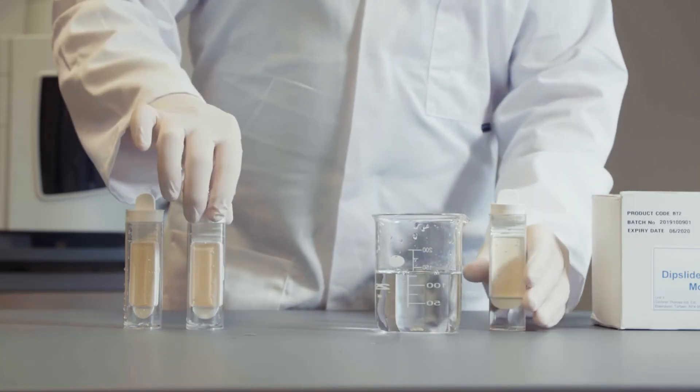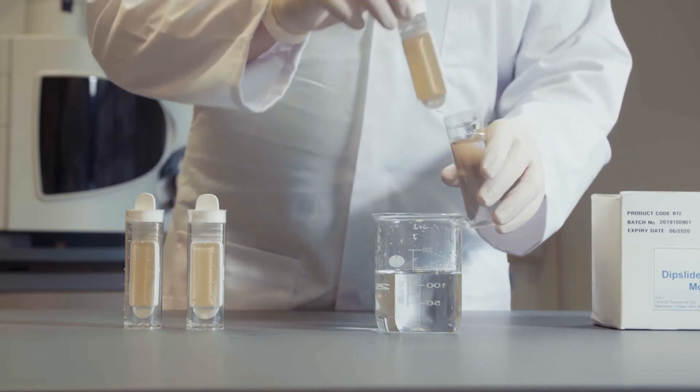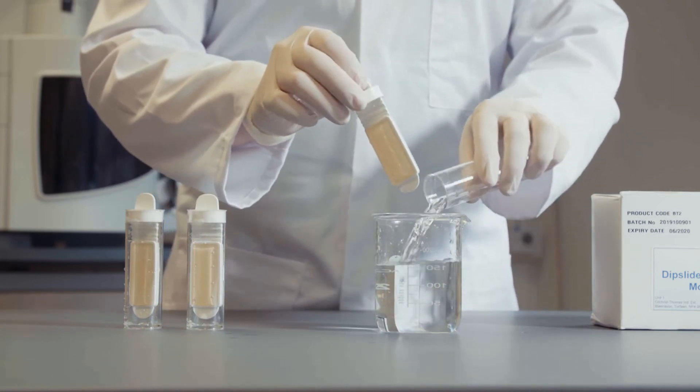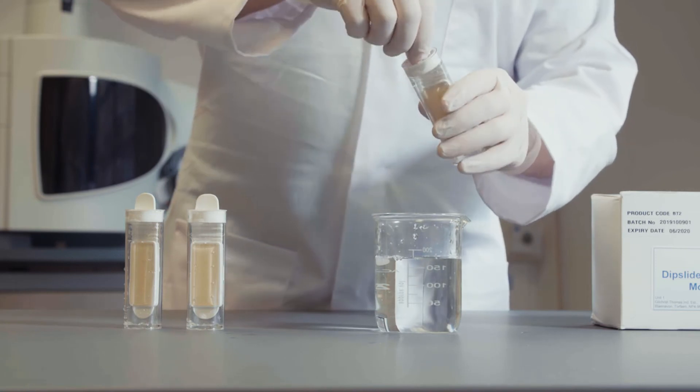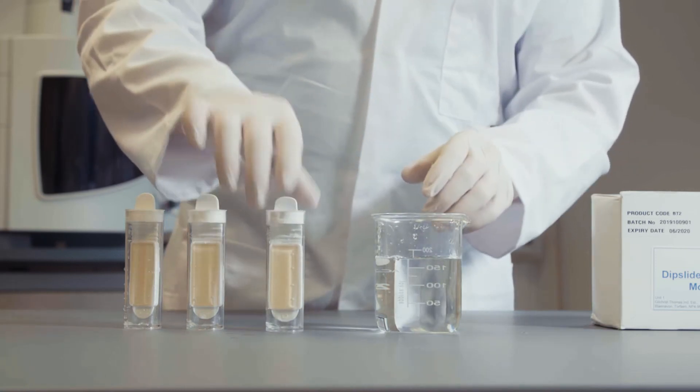After the dip slide has been immersed for 10 seconds, remove the agar paddle again and empty the tube, being careful the agar does not touch anything. Firmly replace the agar paddle to create a seal.